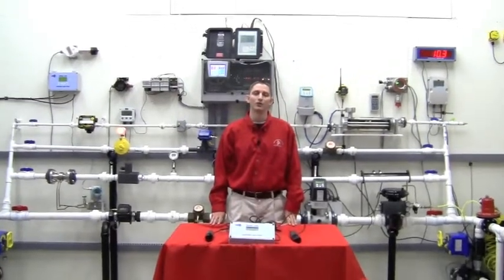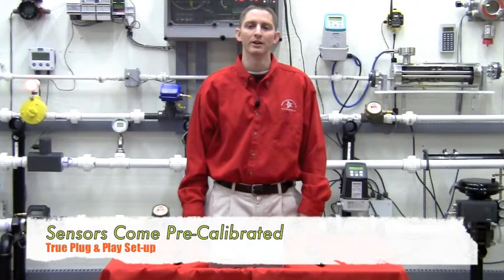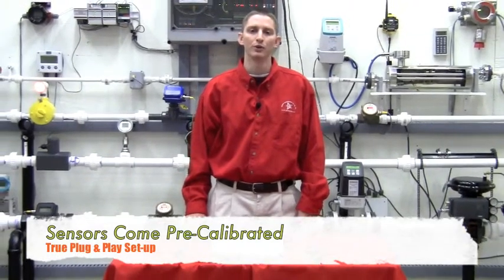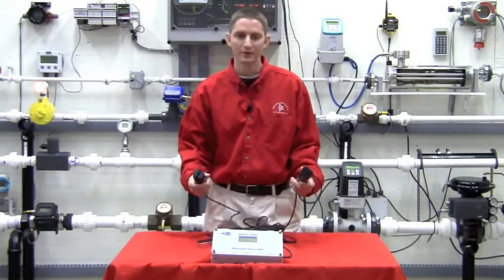Insight has the easiest setup of any dissolved oxygen or total suspended solids monitor on the market today. All of the DO products are calibrated by Insight at the factory, so when you receive your unit all you need to do is provide power and wire your sensors.